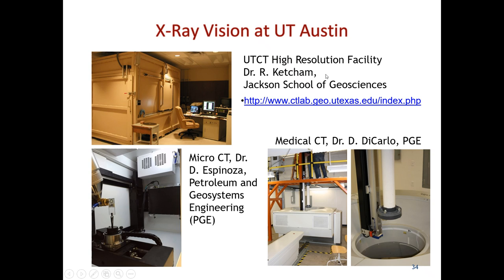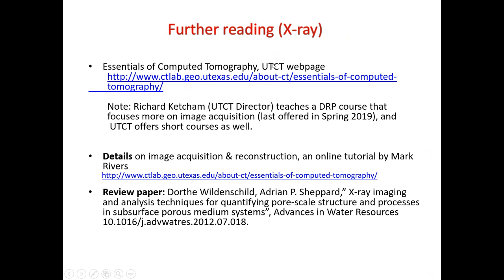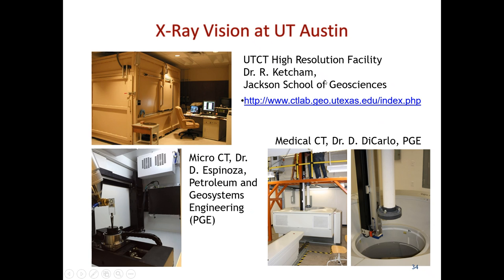At UT Austin, we have seen the lab of Dr. DiCarlo. Today we're going to see the lab of Dr. Espinoza. There is also UTCT, which is essentially an NSF, National Science Foundation, supported facility at Geosciences, where you send the samples and they send the images back. The ones here in the department are within a research group, so they're primarily focused on imaging work done at this department and its collaborations with others. UTCT is actually a facility that you can walk into, and there are physicists that can do imaging for you as long as you pay for it.